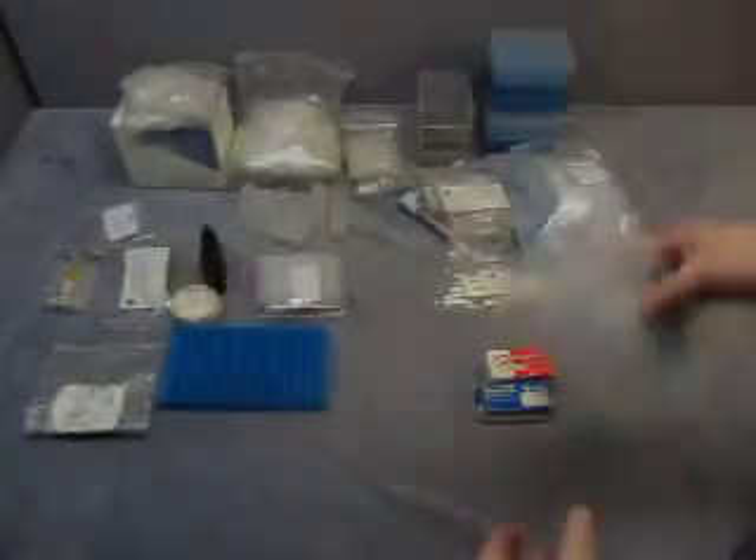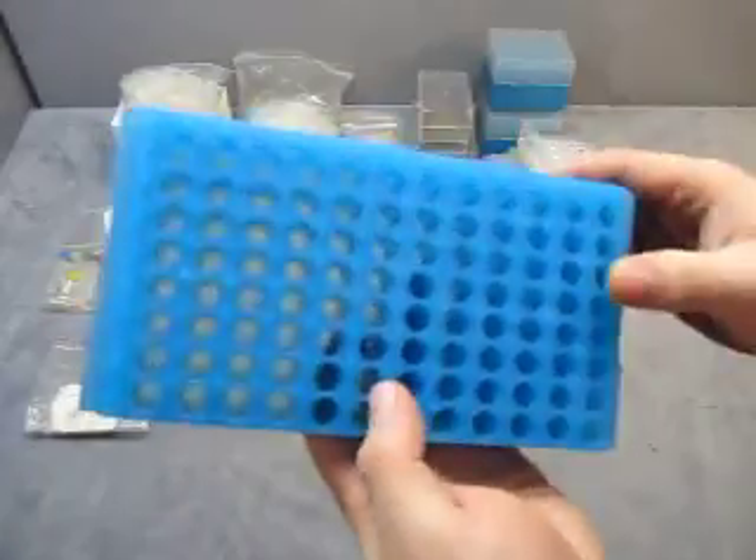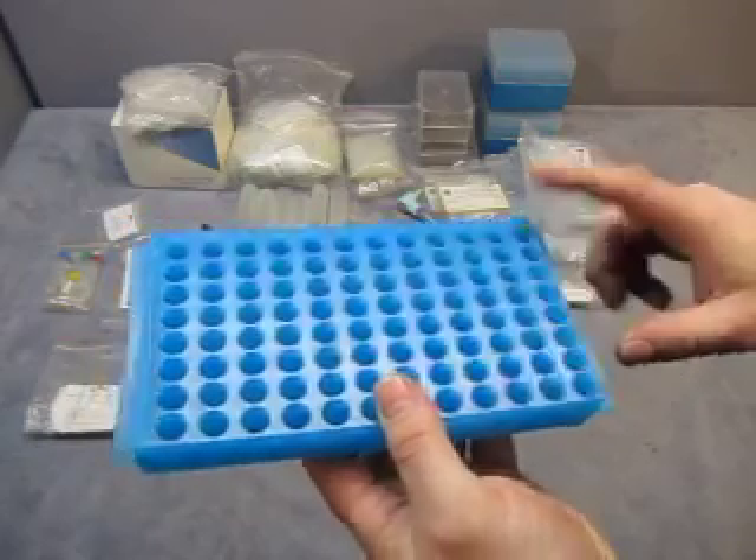Then we have some more tips — there's some blue tips in here, so those go with the others. Then you get a specimen holder. It is labeled A through H and then 1 to 12 on the top.